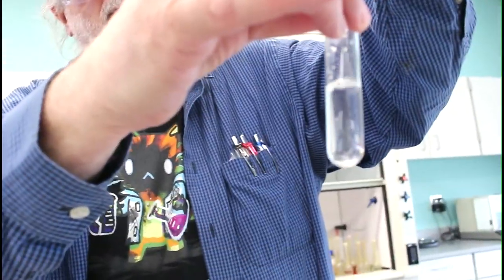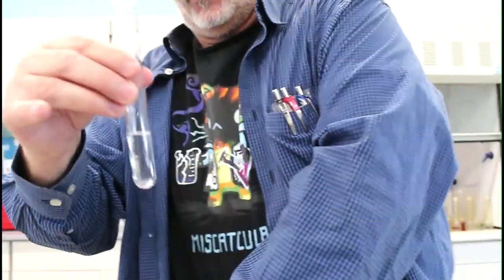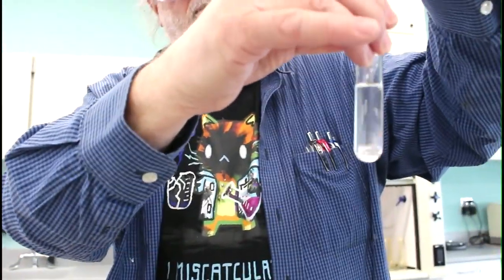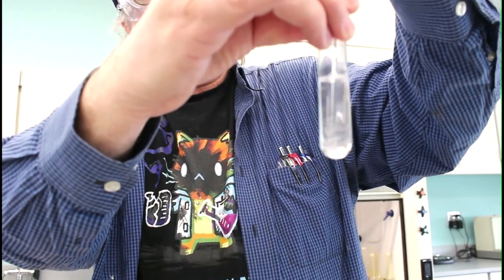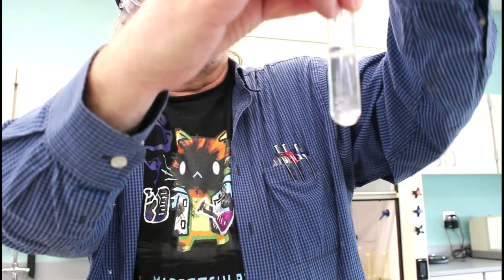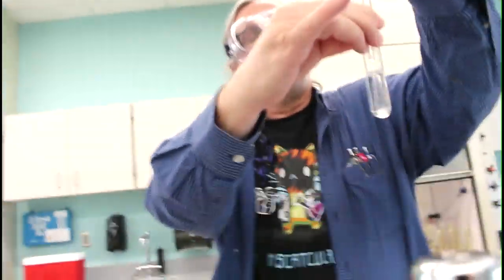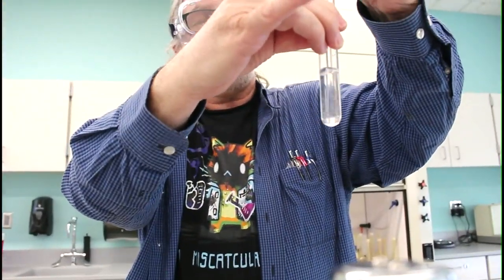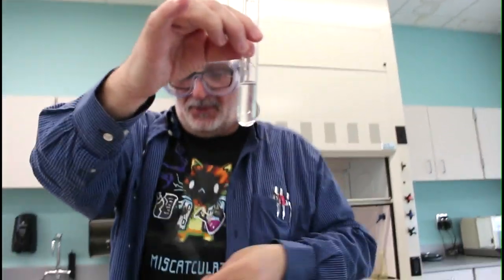Trying to get it against a dark background. That helps. Yeah, that's good. Whoa, it's like almost clear. What happened? Why did it disappear? I wouldn't drink it though. I don't know. Gosh, I hope somebody can explain it to me. The solid's going away. That's pretty neat. Pretty cool. I like that.